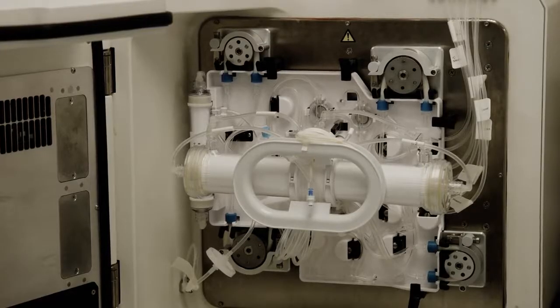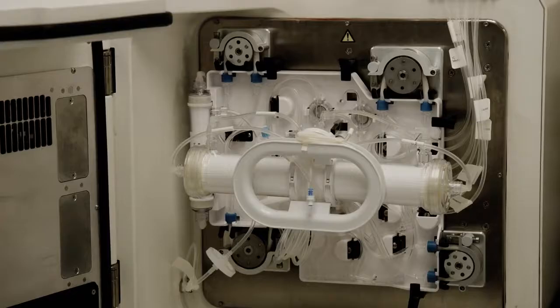This bioreactor allows for a maximum harvest efficiency with a small volume of just 700 mils to ease your downstream processing needs.